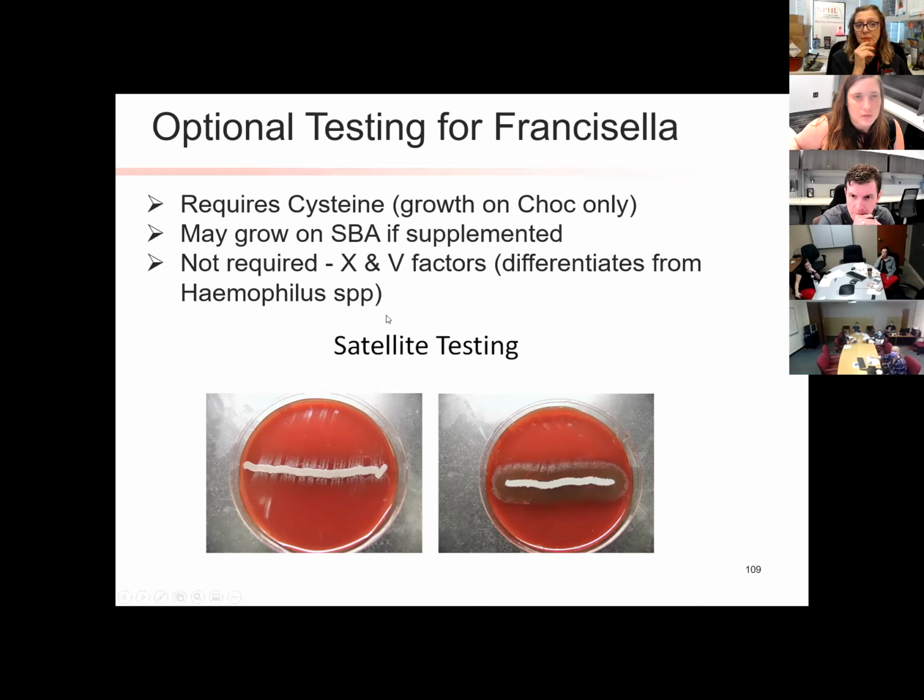And you would see right here where you have satelliting because of the staph. So how the satelliting works is you take your plate, and you sub your unknown organism. Then you sub it this way, up and down, and then take one streak of a Staph aureus and go across. All staph will supply the required factors.